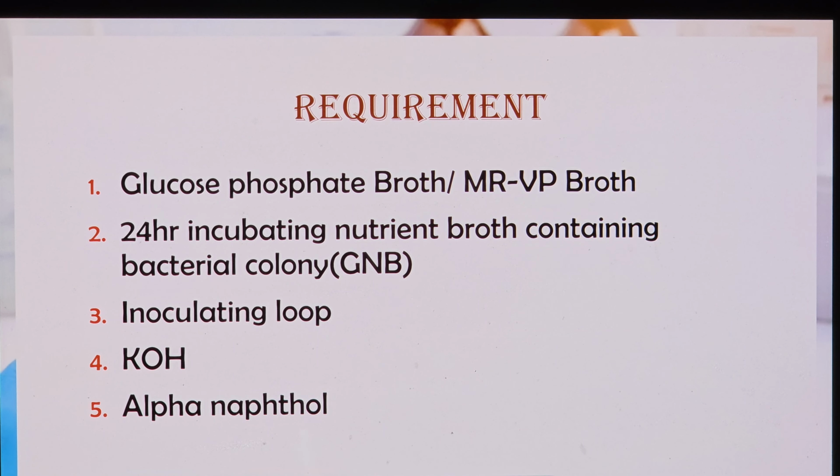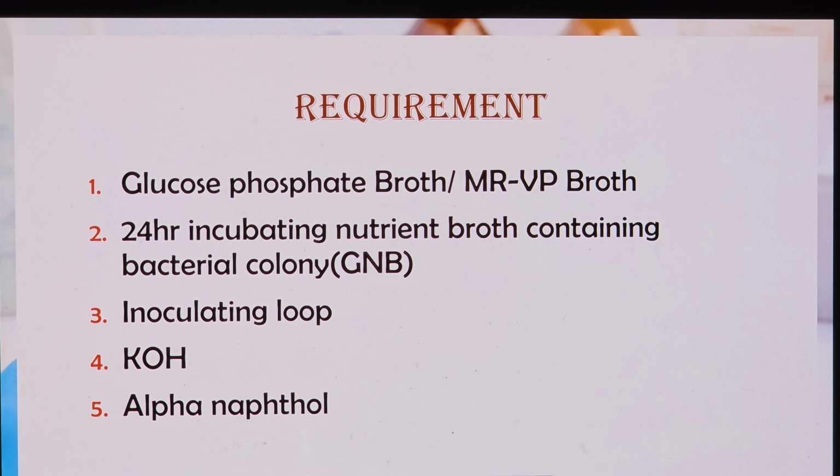What is the requirement? Glucose phosphate broth or MRVP broth. Then 24-hour incubated nutrient broth containing bacterial colony, mainly gram-negative bacilli, inoculating loop, and two reagents are most important in case of VP test. First is the 40% potassium hydroxide and next is the alpha naphthol.